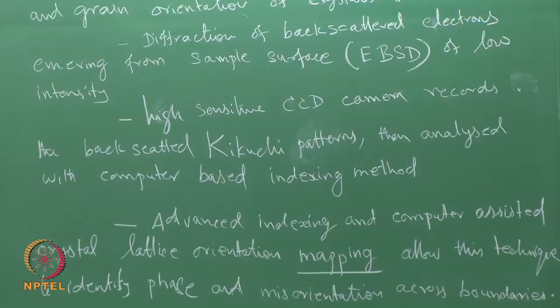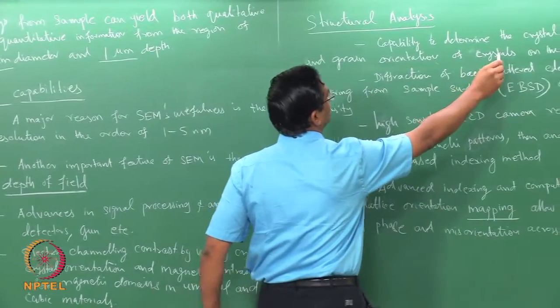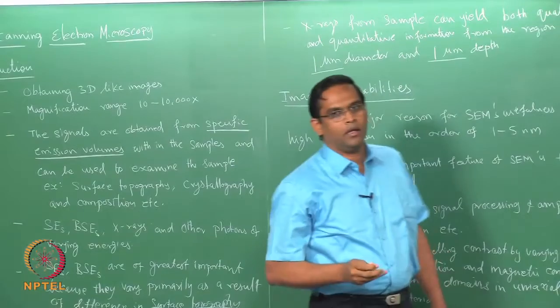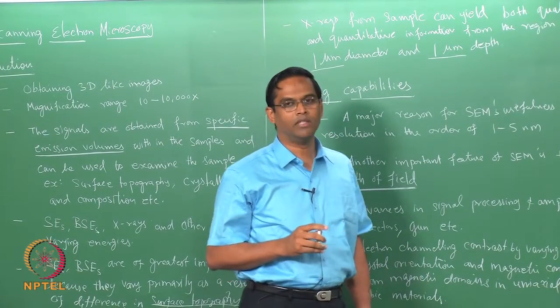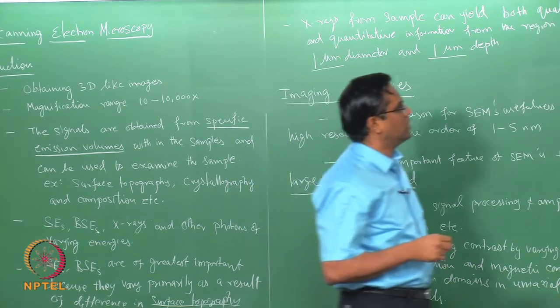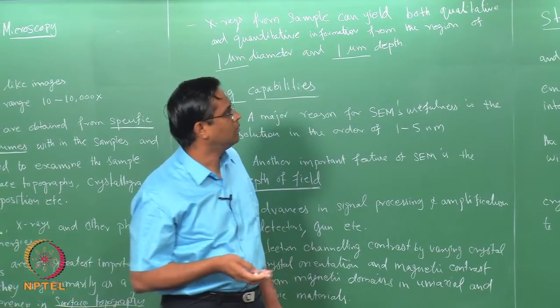If you look at what structural analysis one can do with this SEM, it has the capability to determine the crystal structure and grain orientation of the crystals on the surface. Please understand, you have to remember that whatever information you obtain is only from the surface, with very limited volume. You will understand that in much more detail as we go through these lectures.